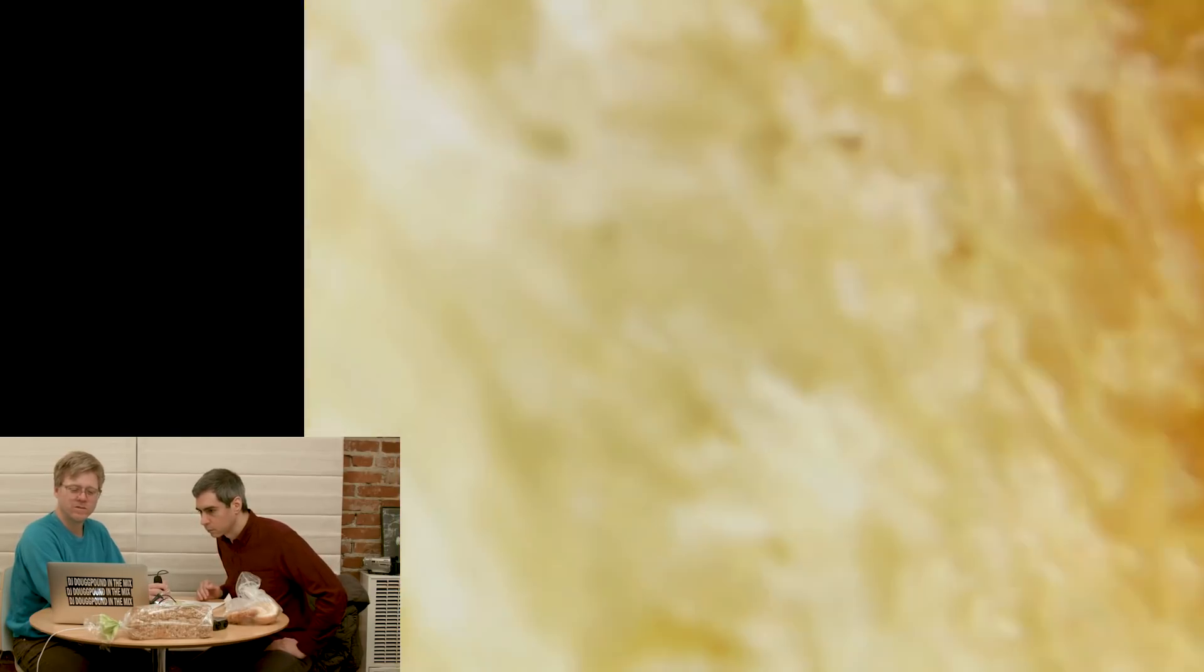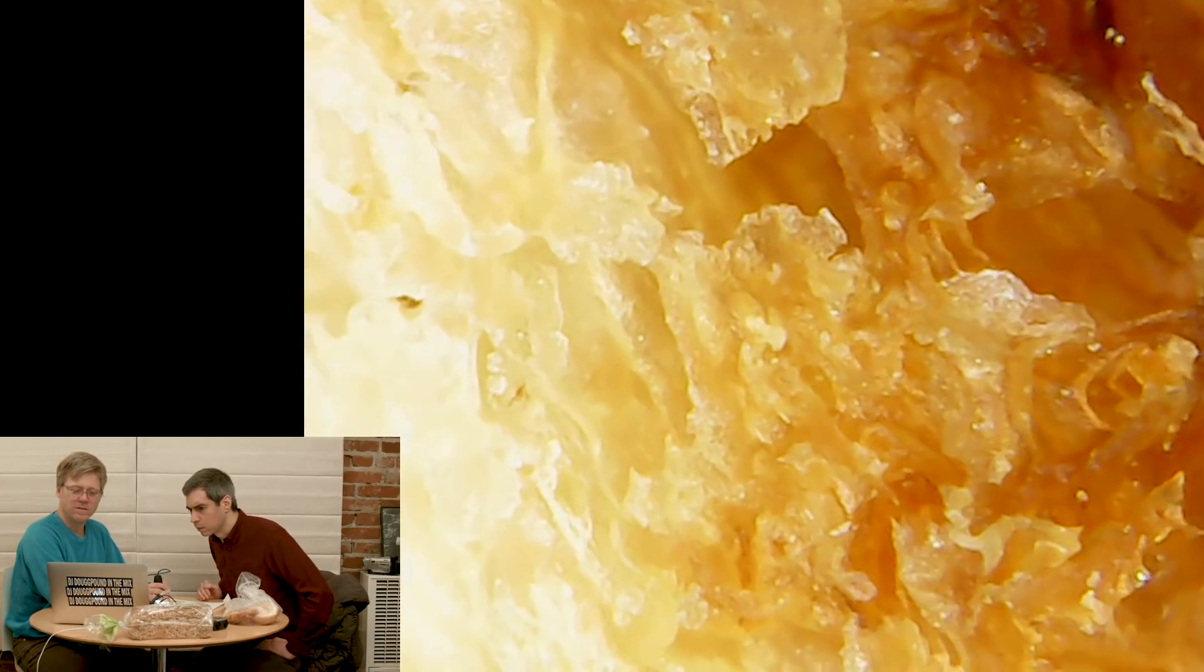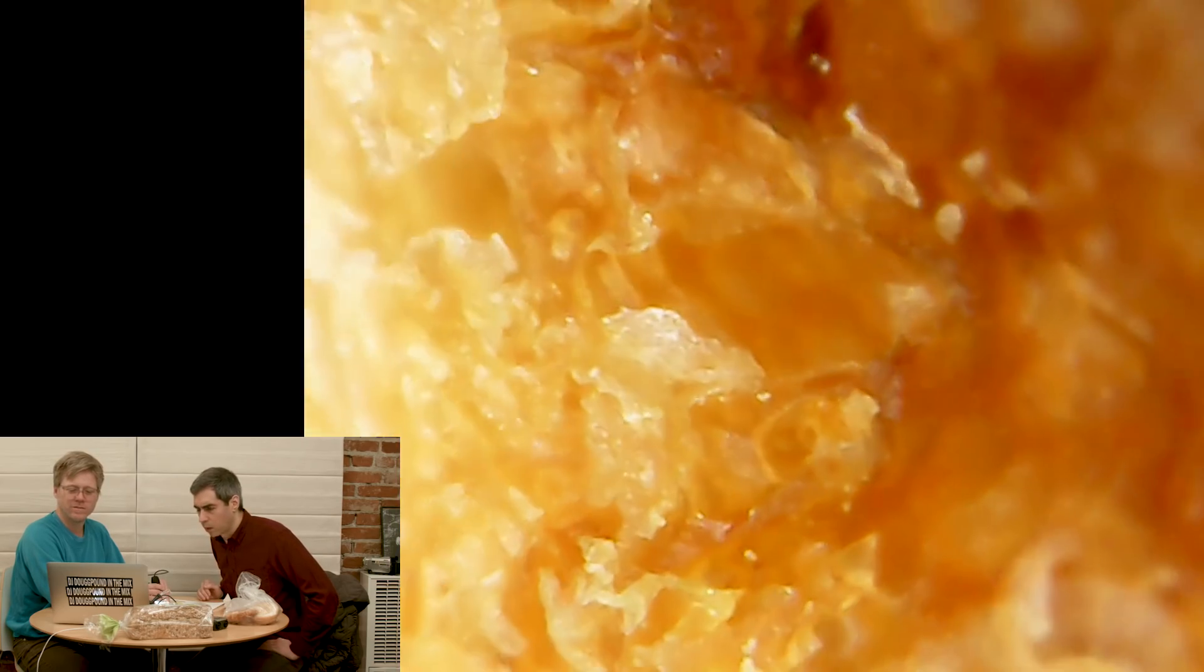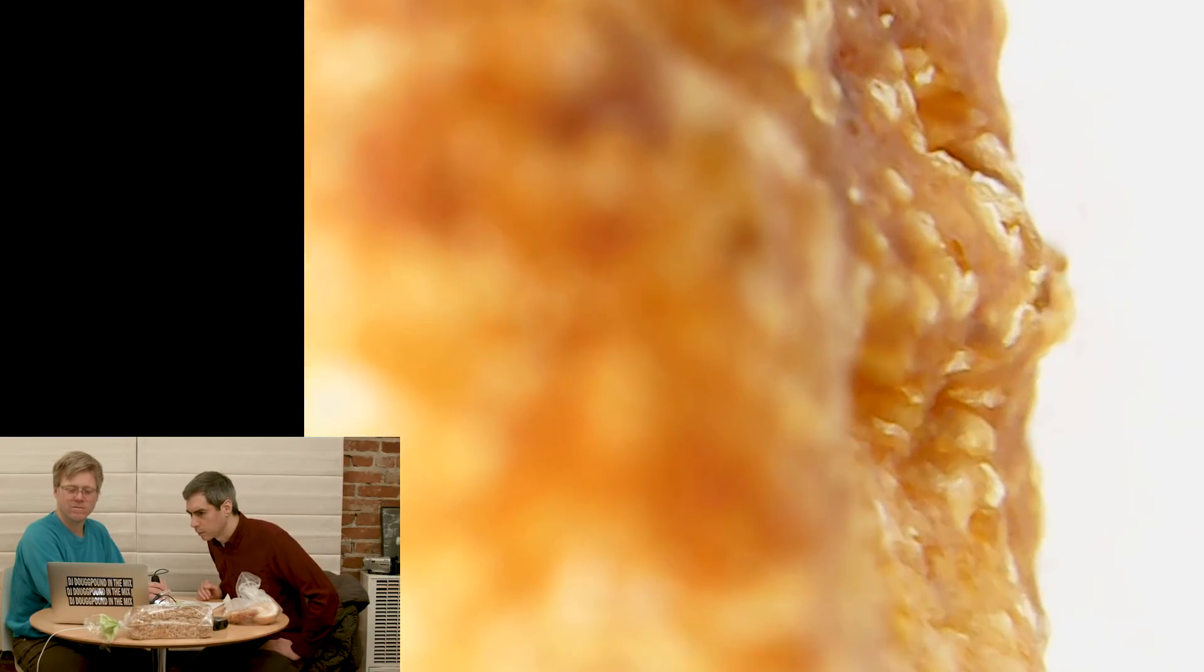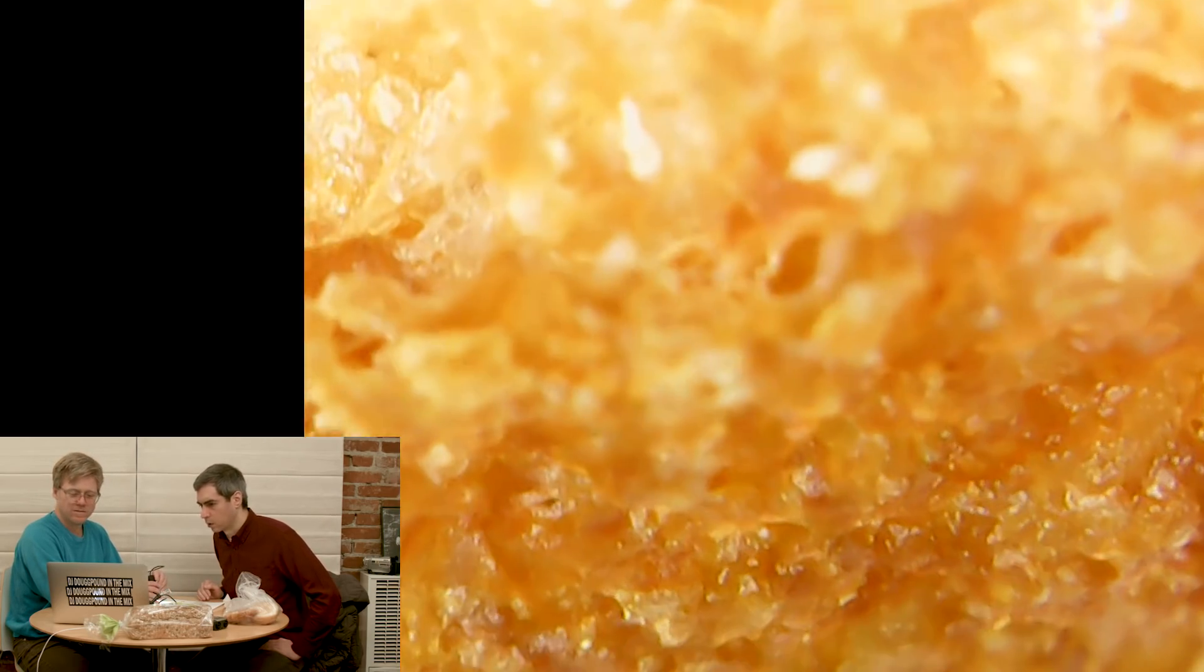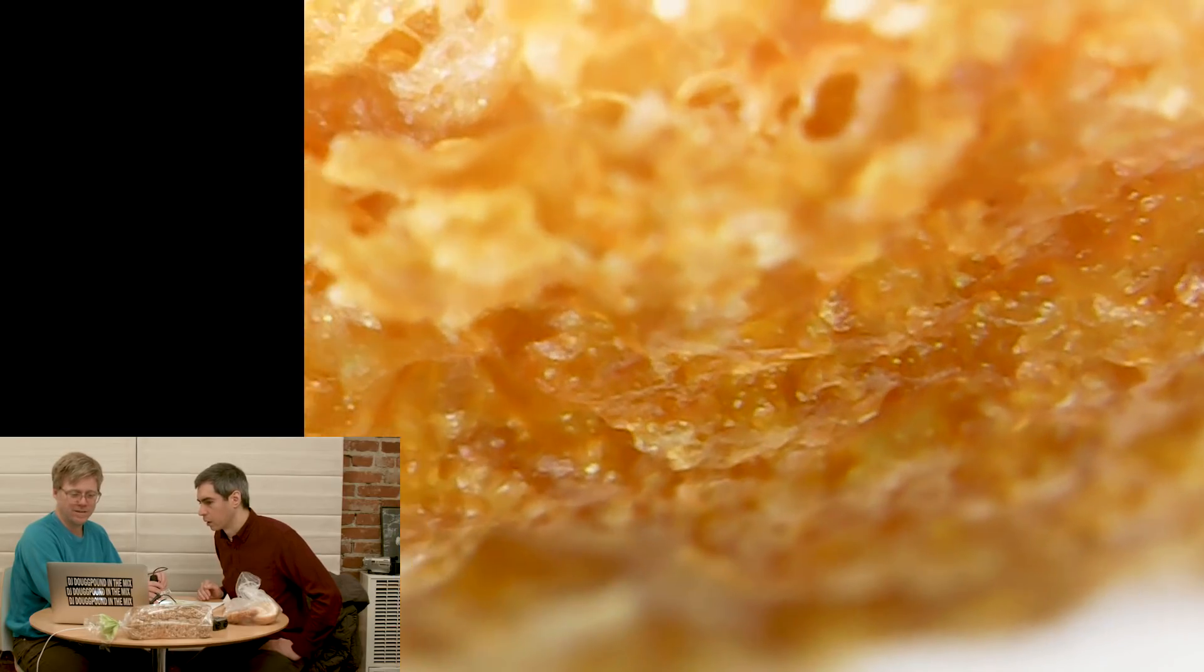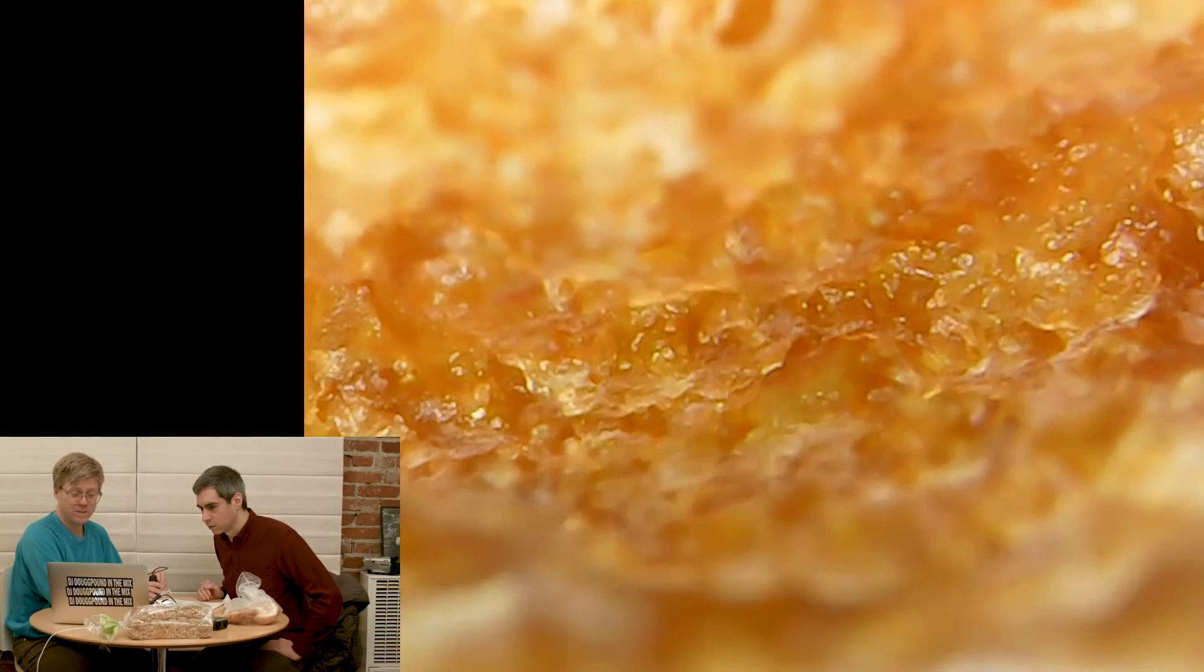I should have got the white bread because this looks so white right now. This is probably all that corn syrup making it. Well, it's so bright. Let's look at the crust here. That's where the crust turns into the, that's transitional right there, huh? By the way, this is a very popular suggestion. That's kind of cool. Look at that rack. Rack focus of the crust. It actually looks like artisanal, I gotta say. Doesn't it? Doesn't this look like artisanal, good quality bread that you're getting in a restaurant or something?